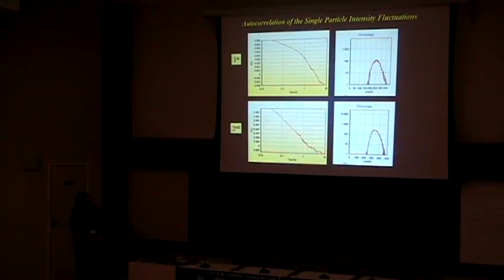That means, as I will show, I think it's here. If intensity is higher, that means FRET is less efficient. If it's less efficient, we have a larger particle. So it fluctuates. Actually, we are watching conformational fluctuations of the particle during the infection process. From the autocorrelation functions, we cannot get much information, but you see the profile of the autocorrelation here and here is different. So we know that the tau, that time constant of our system, is different for this particle and this particle. So this is related with the frequency of the conformational dynamics.